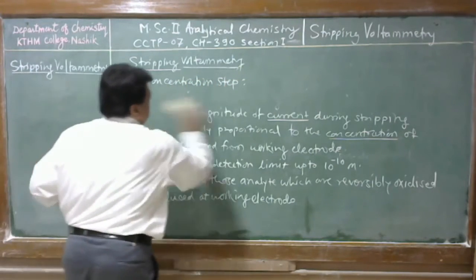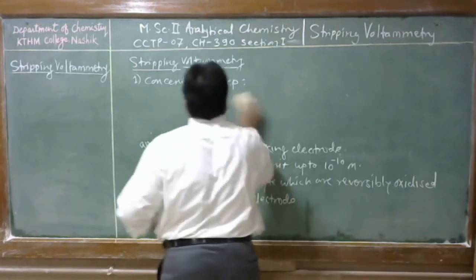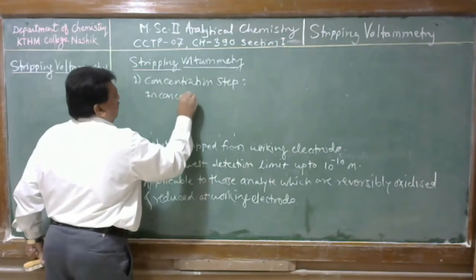In the concentration step, the pre-deposition of the analyte is carried out onto the working electrode.